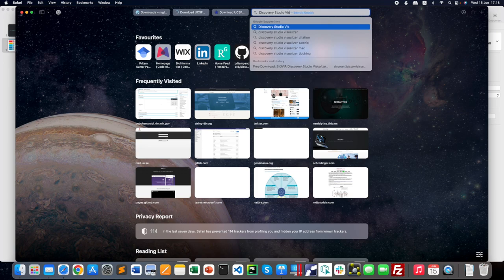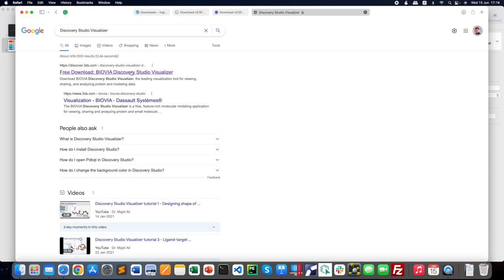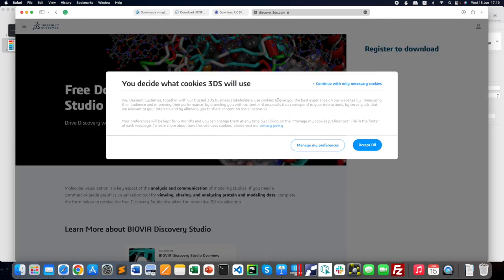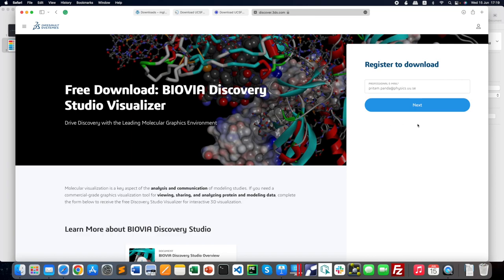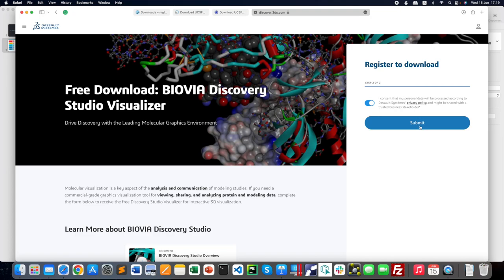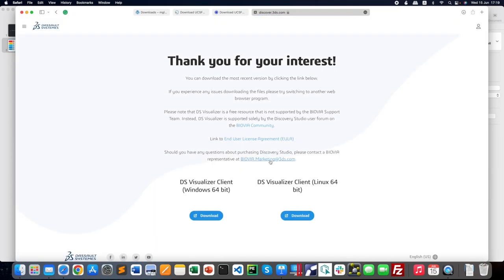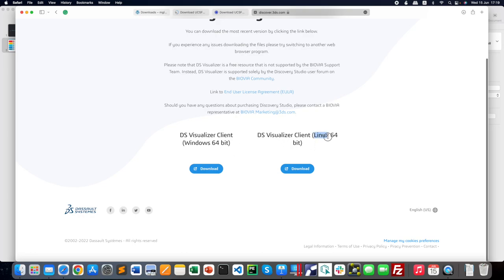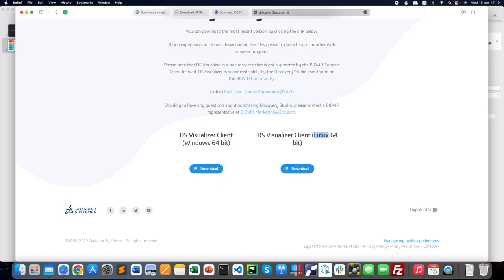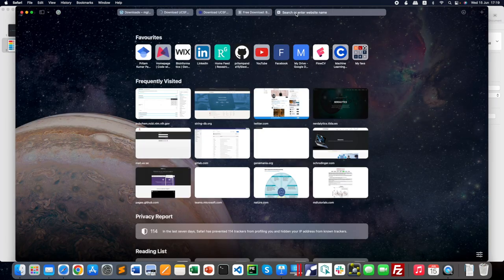The next software required is Discovery Studio Visualizer, from BIOVIA. Go to the website and you have to register using your professional or academic email, then accept the consent. It is available for Windows and Linux platforms. The Mac version of DS Visualizer is not yet available, so I recommend using Linux or Windows. Windows users can download the DS Visualizer client.